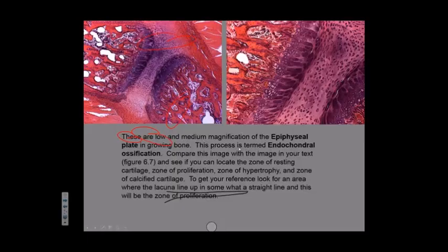So this is somebody's digit, and it's developing bone. So these are 2 bones in 1 finger. All this out here, this is all bone in here. This is bone in here and in here. And if you look really hard, you can see some little dots. Those are the central canals of the Haversian system. Not high enough magnification, but you can see the dots a little bit better over there.